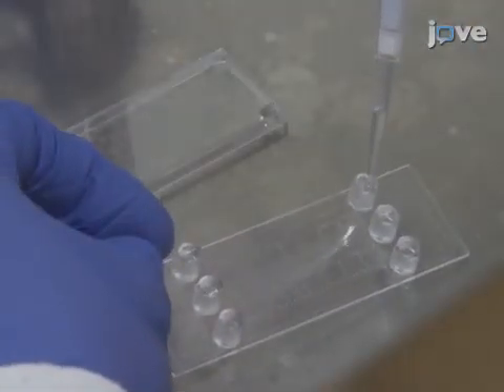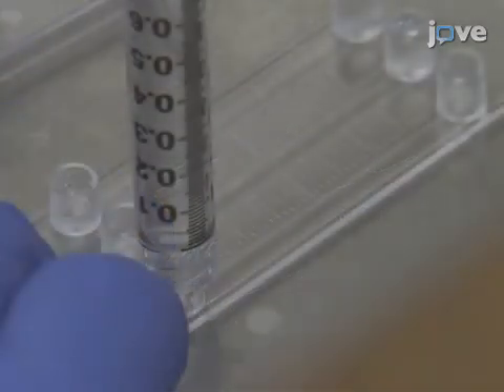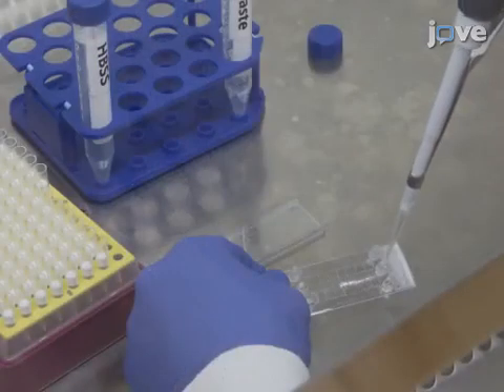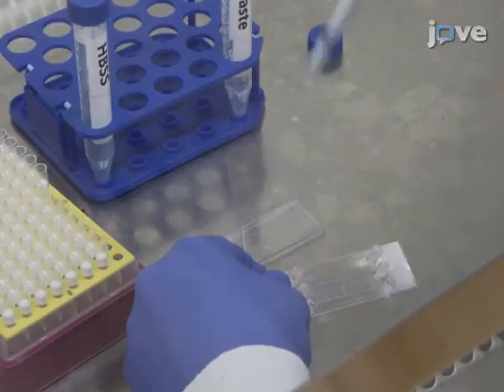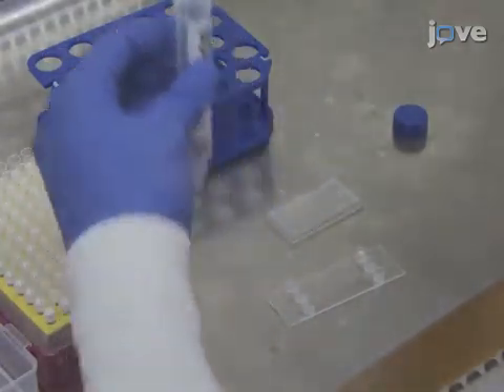The next day, use a 200 microliter pipette to remove the collagen coating buffer. Then rinse each lane with HBSS, aspirating the saline with a 200 microliter pipette. After the third round of HBSS has been discarded, add approximately three times the volume.